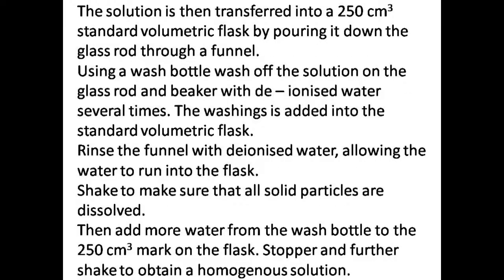Then the solution is transferred into a 250 cm³ volumetric standard flask by pouring it down the glass rod into a funnel. Using a wash bottle, wash off the solution on the glass rod and the beaker with deionized water several times. The washing is added into the standard volumetric flask. Rinse the funnel with deionized water, allowing the water to run into the flask.